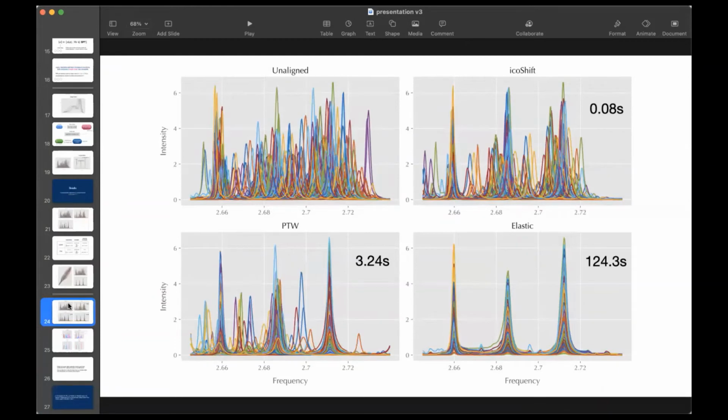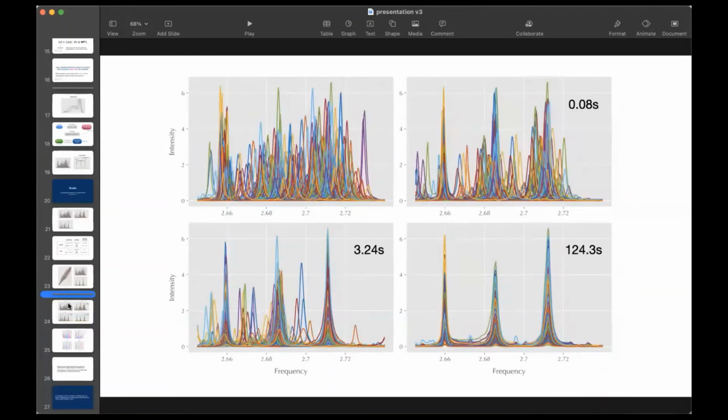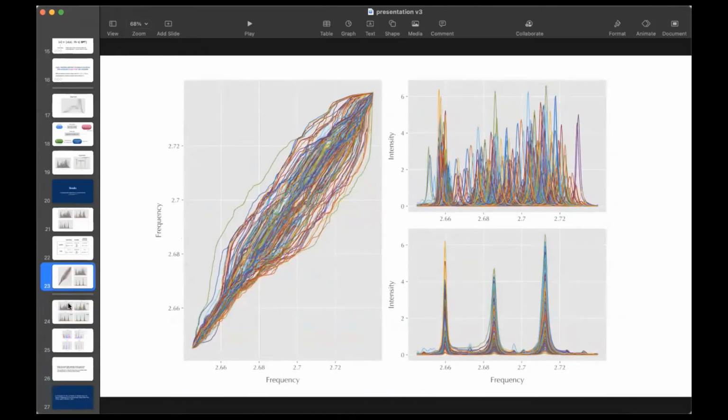As far as I know, in elastic registration there are no constraints, and whatever the phase variation is, it will just go and find that through the warping functions. I'm sorry if I didn't answer your question.